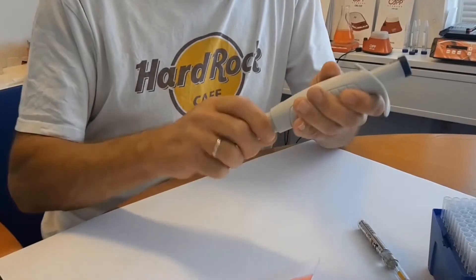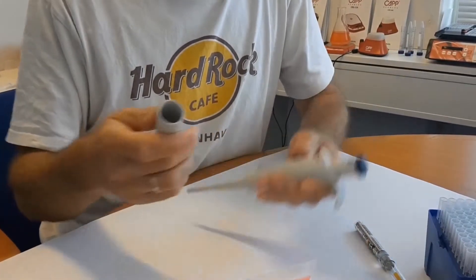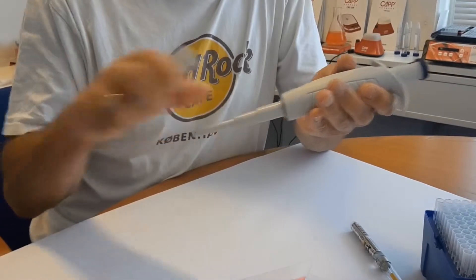Remove the tip ejector off the pipette by gently unscrewing it. Check for any visual signs of contamination. Verify that the tip cone assembly is firmly attached and test for leakage once again.